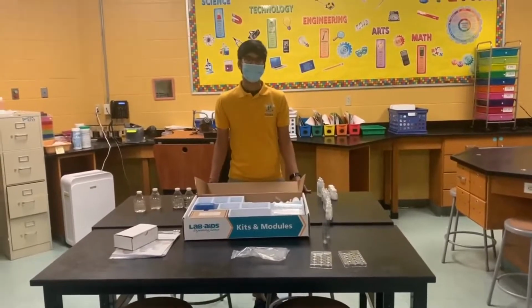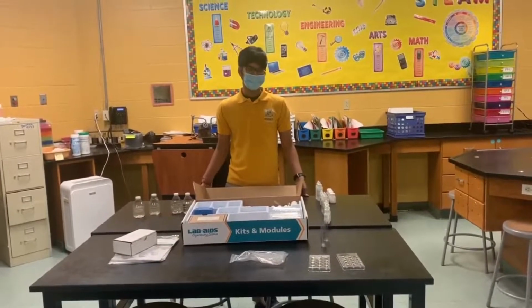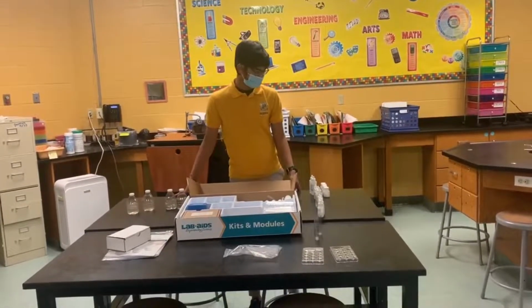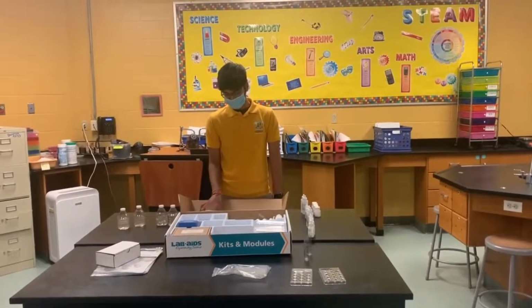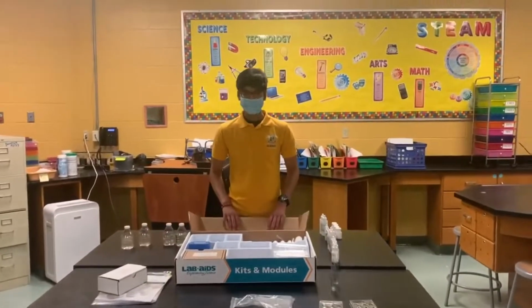Most specifically, color changes. The denser the color change, how much the color changes, represents the amount of contaminants the water sample contains. We tested for pH, chlorine, chromium, nitrate, phosphorus, and sulfides.